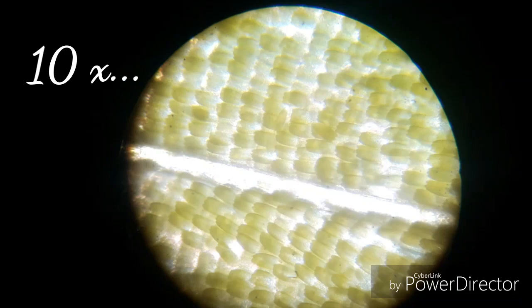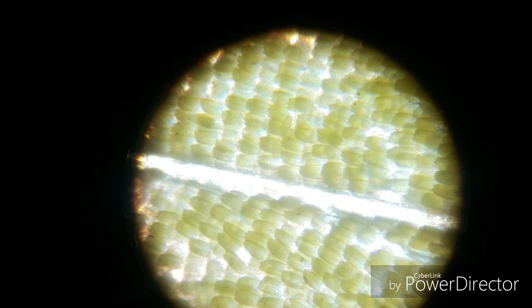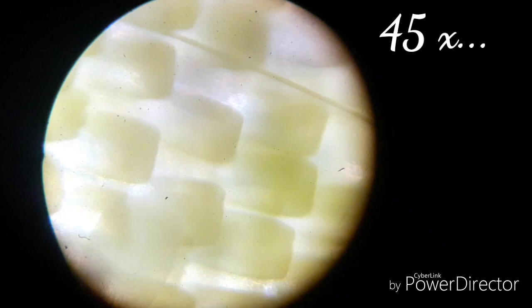Here are the wing scales of Common Grass Yellow under 10x magnification. You can see how beautiful their arrangement is. The narrow white channel among the scales is a magnified vein of the wing. This is just an example of nature's beauty. Now this is the wing of Lemon Pansy.